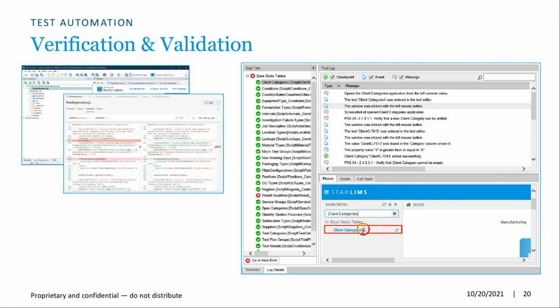They don't update the operating system. They don't update their browsers. They don't update anything, because if you have to update something, you have to generally validate what you're doing again to make sure that everything is still working properly. And you get locked into this validation wormhole, is what I'll call it, where you want to make changes and you want to get updates, but you know that it's going to take time and effort, so you decide not to.